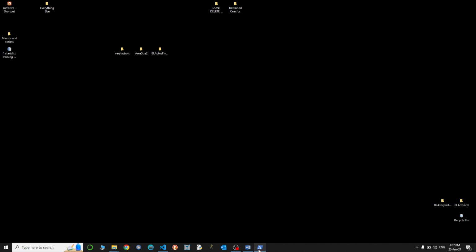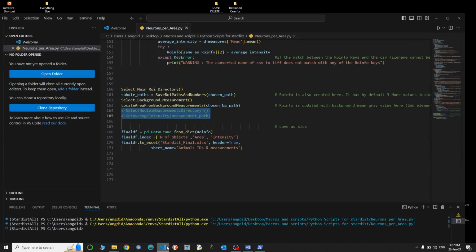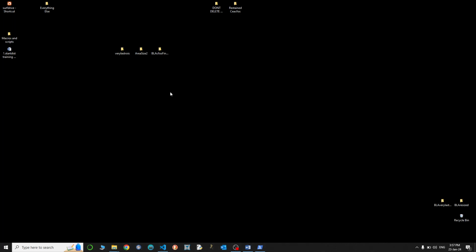So now let's see if the script is already run. I should tell you, because I was quite lazy when I was making it, that you should know how to search for the file that's created because you haven't selected a directory.